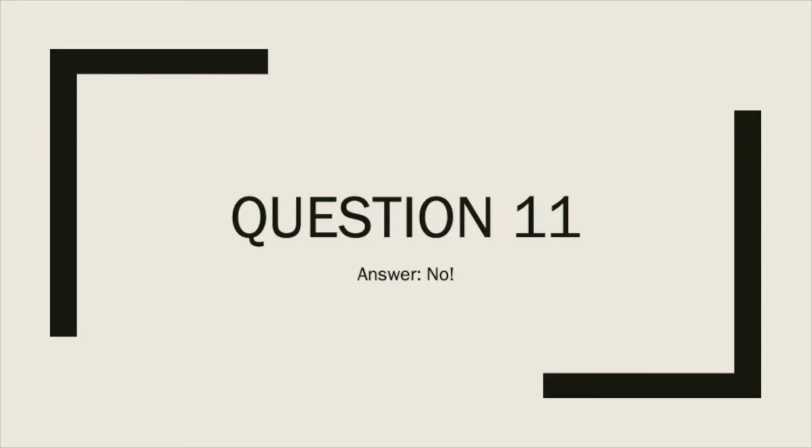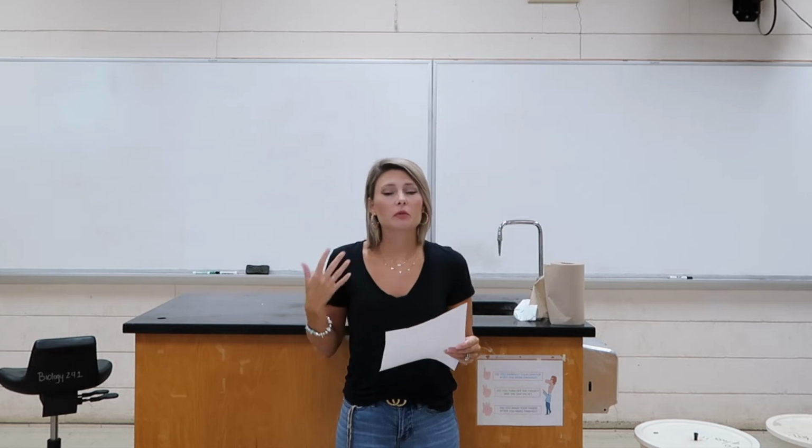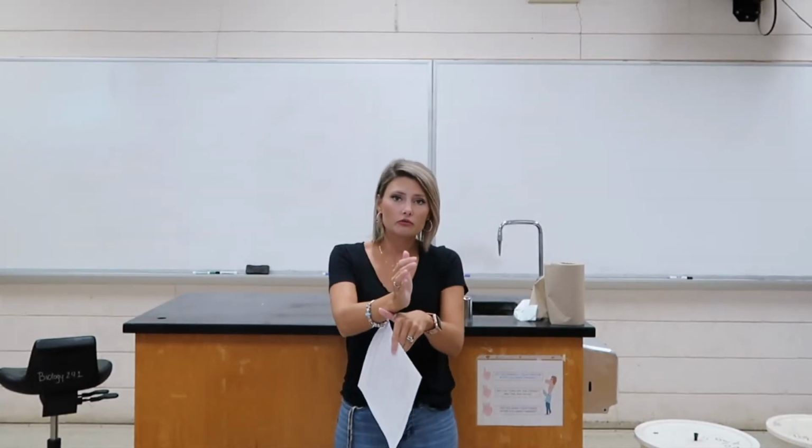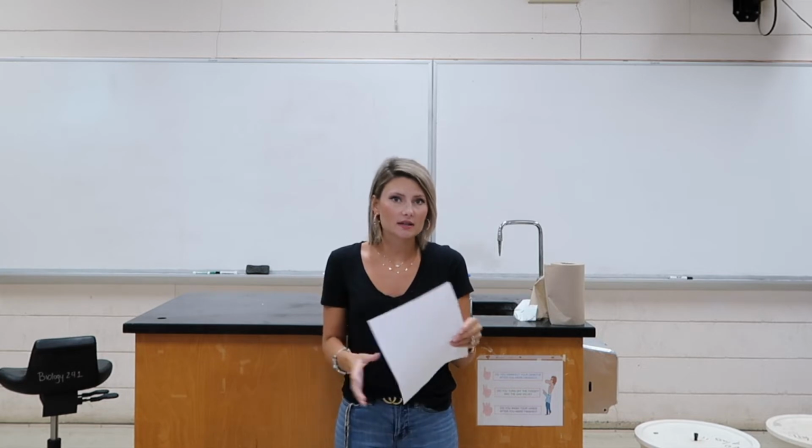Number 11, should you wear latex gloves while using the Bunsen burner or Fireboy? No. When latex gets hot, it melts. So anytime that we have the Bunsen burners on, you are not going to be wearing your gloves. It's just a safety precaution, because a lot of times the Bunsen burners are on for a long period of time. People forget that they have them on, and the gloves go farther up your arm, so sometimes you will accidentally put your hand in front of it or something like that, and it could melt.